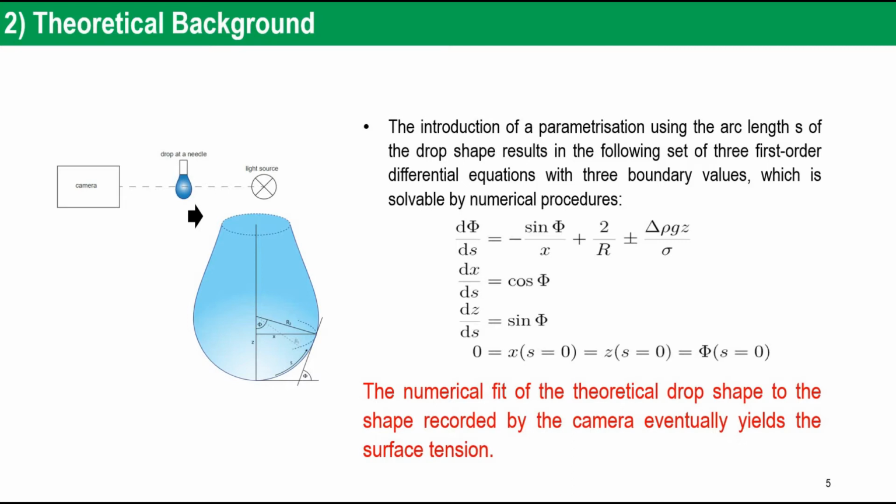The numerical fitting is a complicated process, but the pendant drop tensiometer installed with DROP Image Advanced software offers a simple and elegant solution to determining surface and interfacial tension.